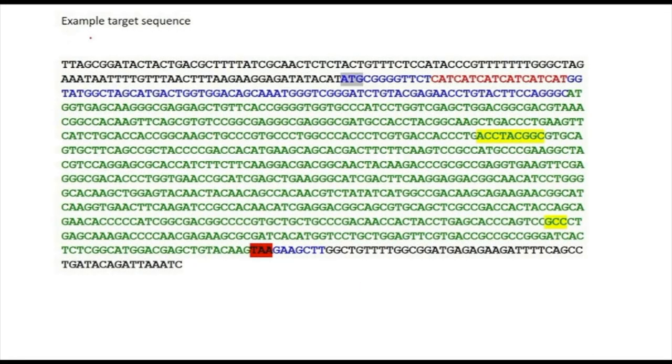So for understanding purpose, I gave this sequence. I will use this sequence to design the primers and analyze the primers. This is the whole sequence, but I don't want to amplify the whole region. I want to amplify the sequence which is highlighted in green, starting from here to here.